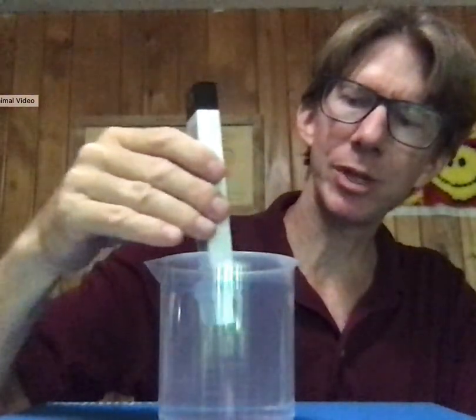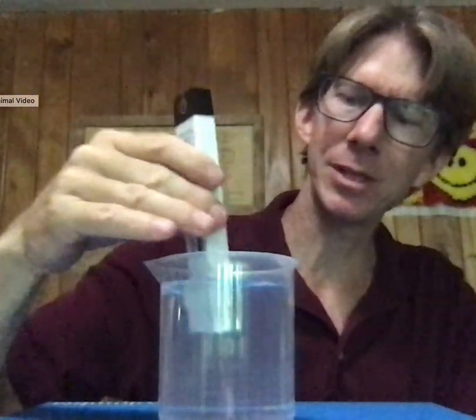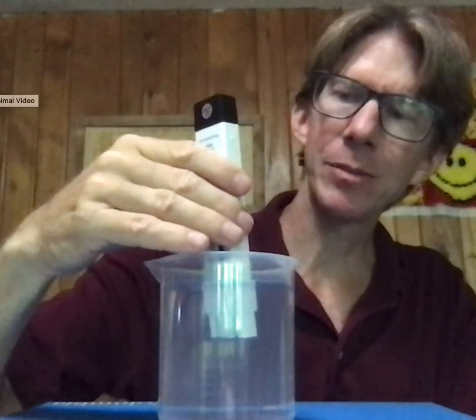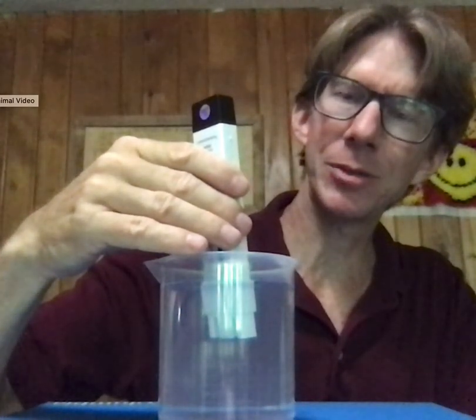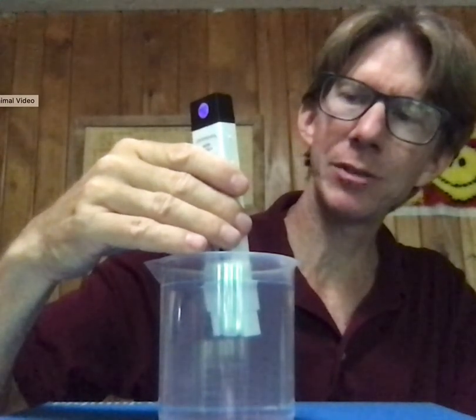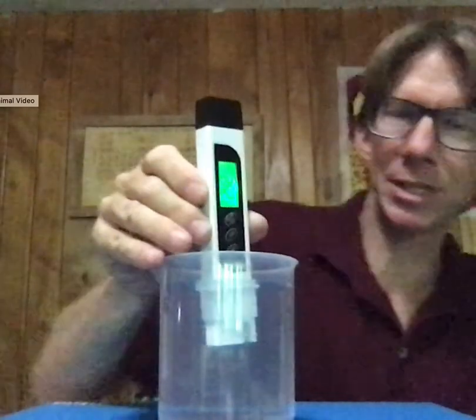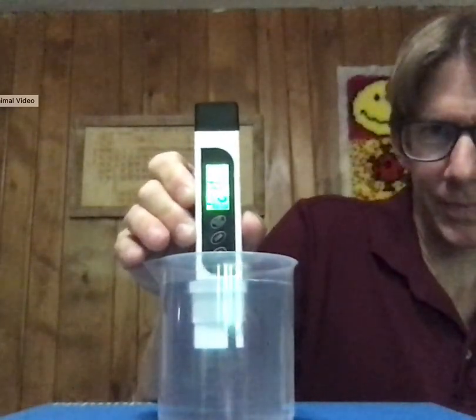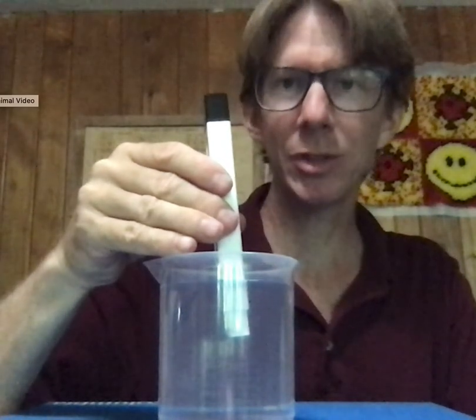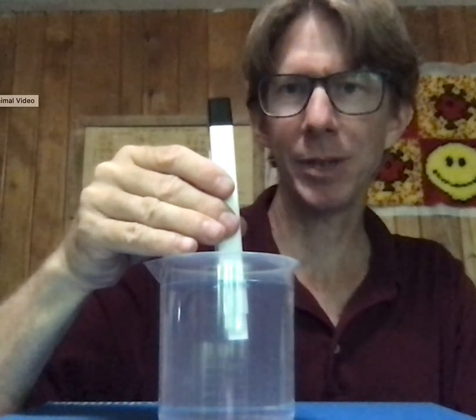So roughly 24 — I didn't really give it time to equilibrate. I'm going to swirl it a little bit to make sure I've got the right temperature. And I'm reading 24.2 degrees Celsius right now. I will record the 24 and the 0.2. Always record all of the digits on your thermometer.